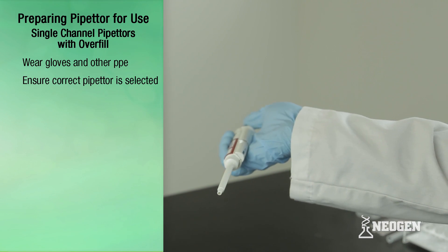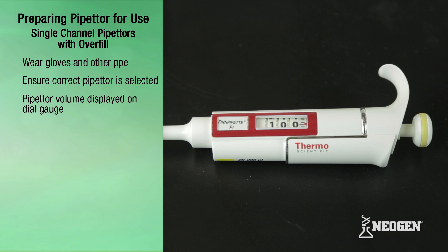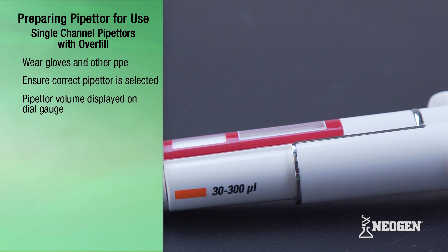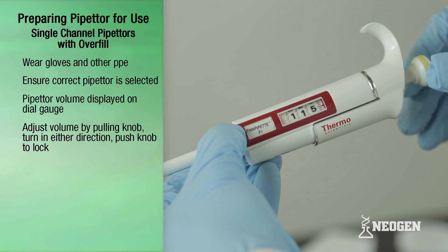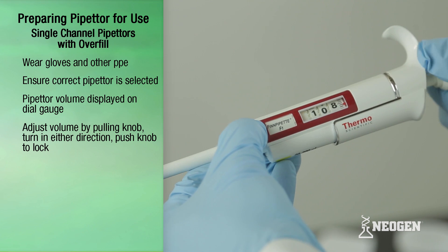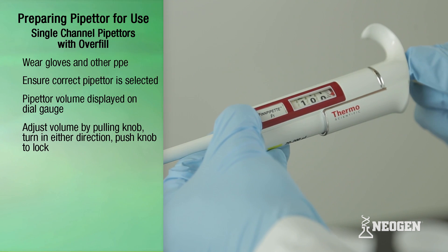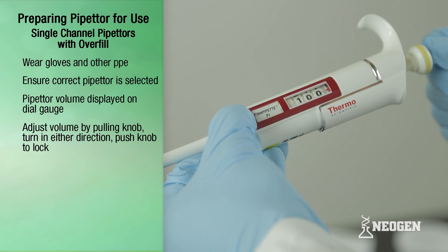The volume a pipetter can draw and dispense is displayed on the dial gauge on the outside of the pipetter. To set an adjustable pipetter's volume, pull the knob on the top of the pipetter plunger and turn the knob in either direction to adjust the setting. Once the correct volume is selected, push the knob back to the original position to lock it into place.